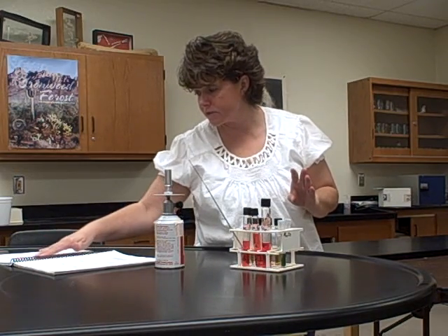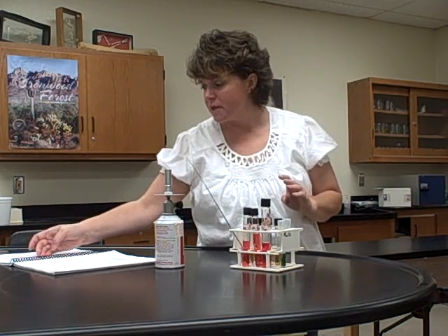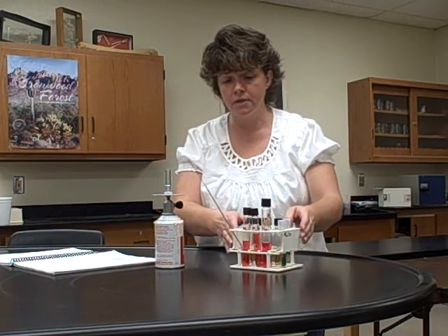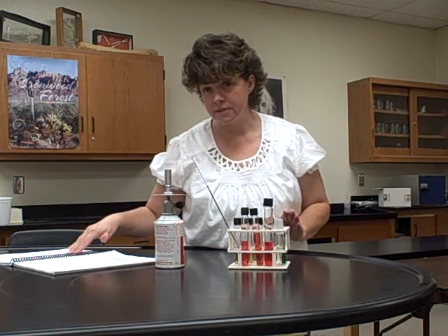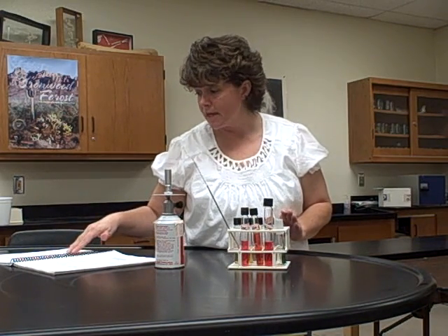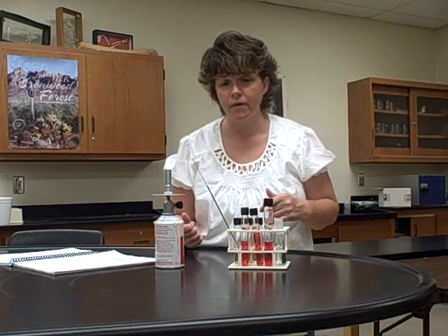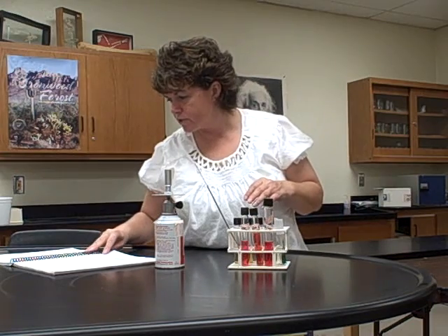Turning to page 95, there's a list of cultures that are going to be used: E. coli, Enterobacter aerogenes, Alcaligenes faecalis, and Proteus vulgaris. For the first part, which is the fermentation part, the procedure below that says procedure fermentation tubes, I am going to assign you particular cultures to use. I'll go group by group, and I'll give every group 1 or 2 cultures. I haven't decided yet.